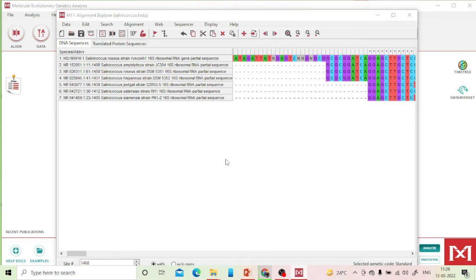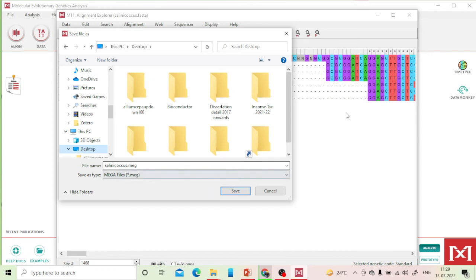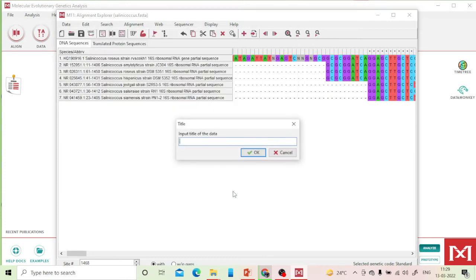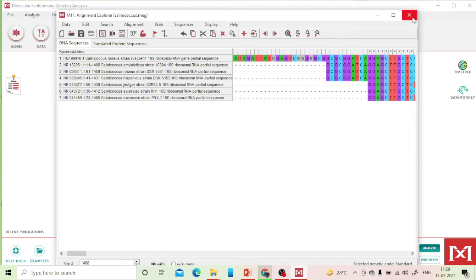Save the alignment on the desktop — MEGA automatically appends the '.meg' extension. Earlier the sequences were saved in FASTA format; now after multiple sequence alignment, we save in MEGA format. MEGA reads the '.meg' format for phylogenetic analysis. Click OK and close the alignment window.